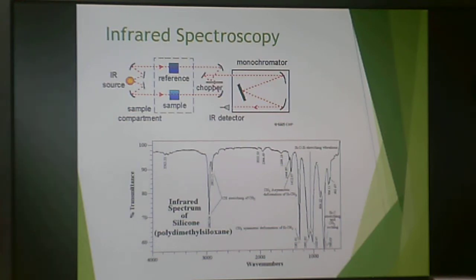So what do you get from infrared spectroscopy? Here you have your schematic of the instrument. This is your output. What you get is a baseline with a whole lot of squiggles on it. Doesn't this look like a huge mess? It is, but if you know what each one of these bands corresponds to, you can actually see the chemical groups that are present in the backbone. I did this for 5 years, looking at one specific molecule every single day.